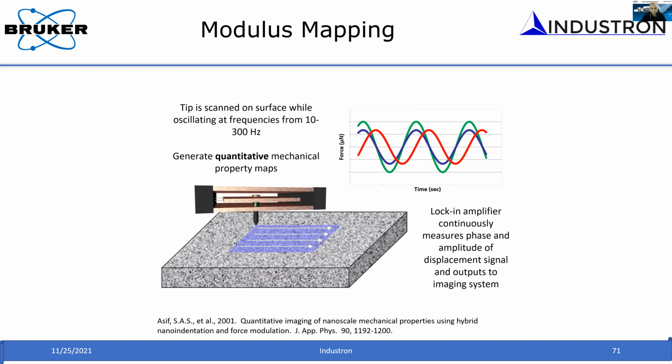That is the kind of high resolution you can reach. If there is diffusion of a few atoms in contact, you are able to measure that. So even for materials like ceramics and tungsten, which we believe don't creep, you can actually measure creep. So you can measure the creep response of these materials as well. So these are all the things that you can measure.